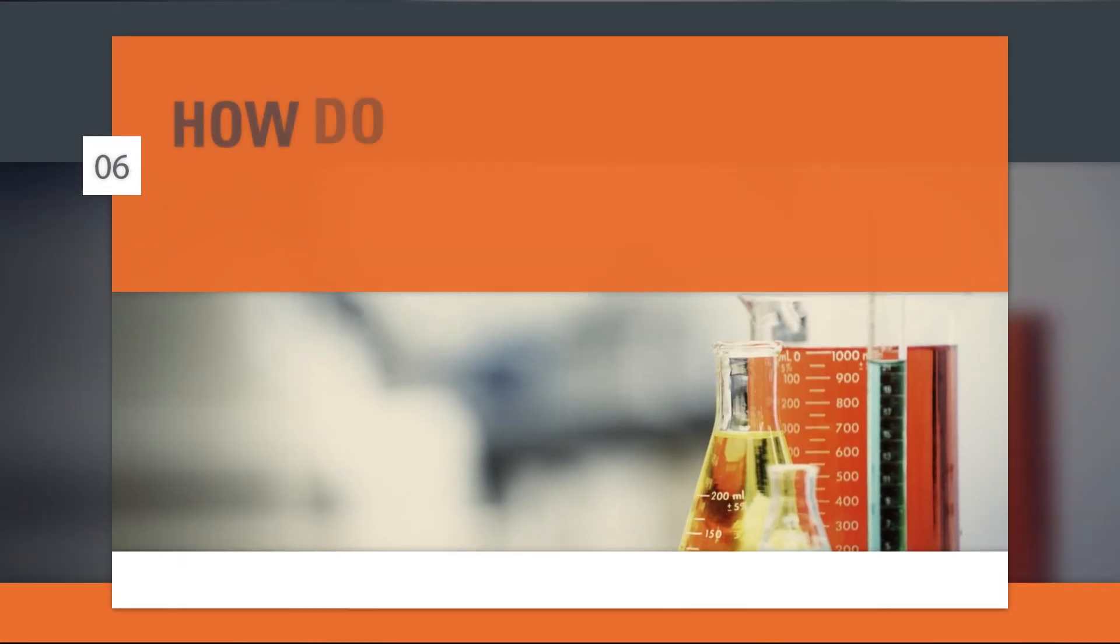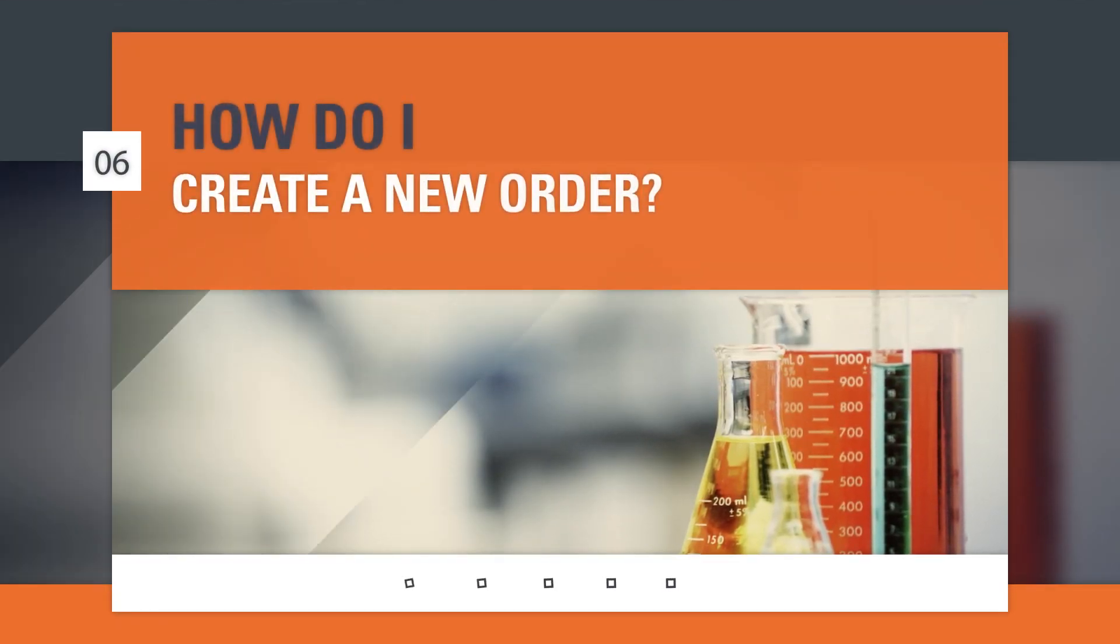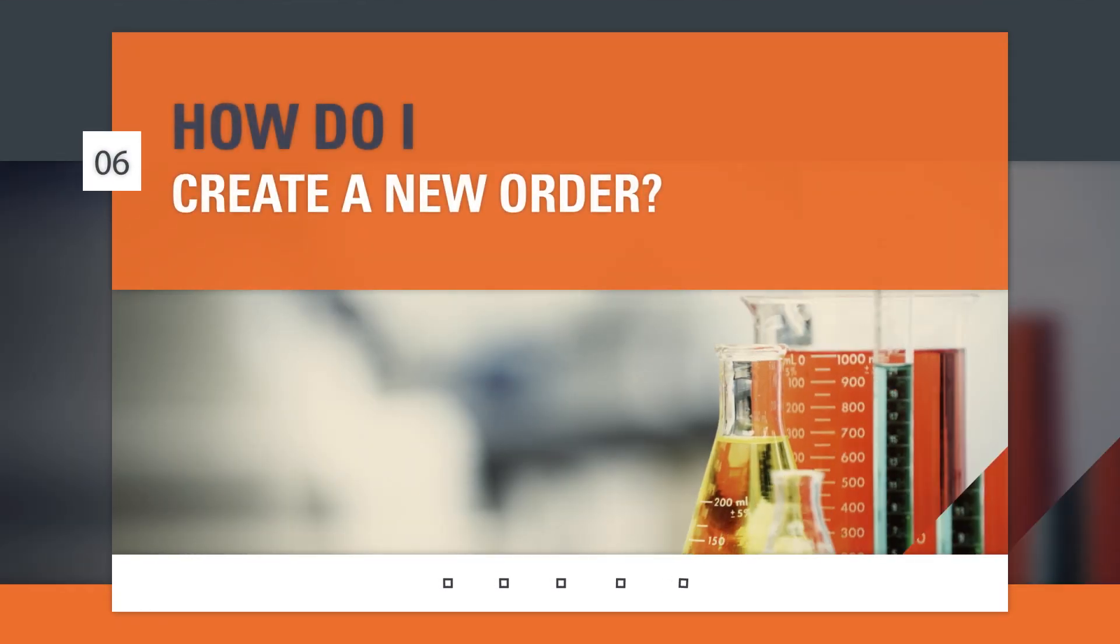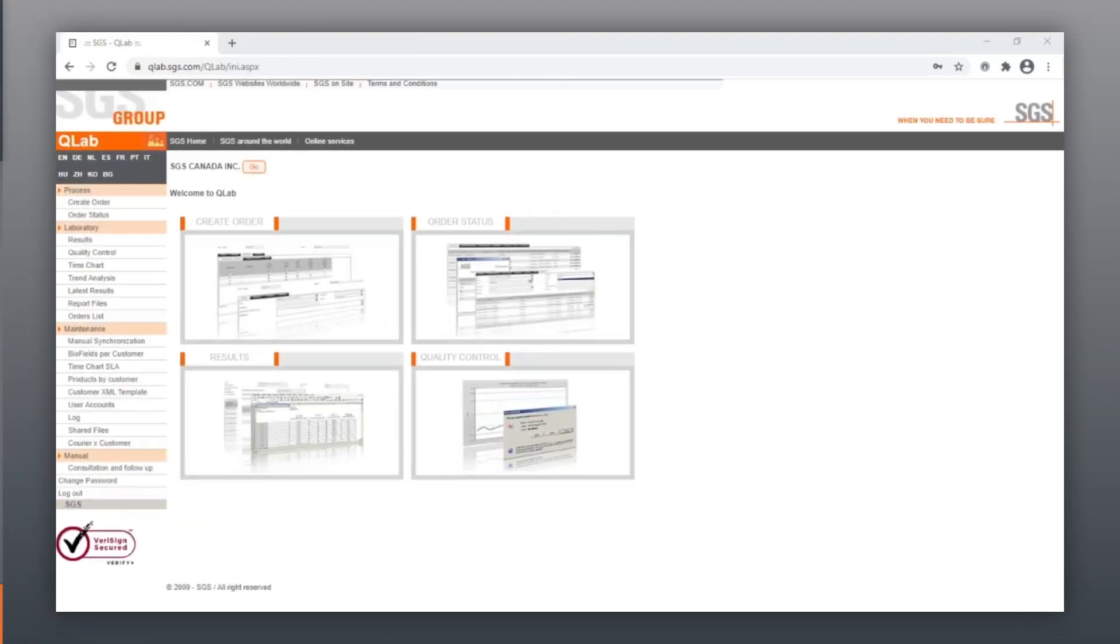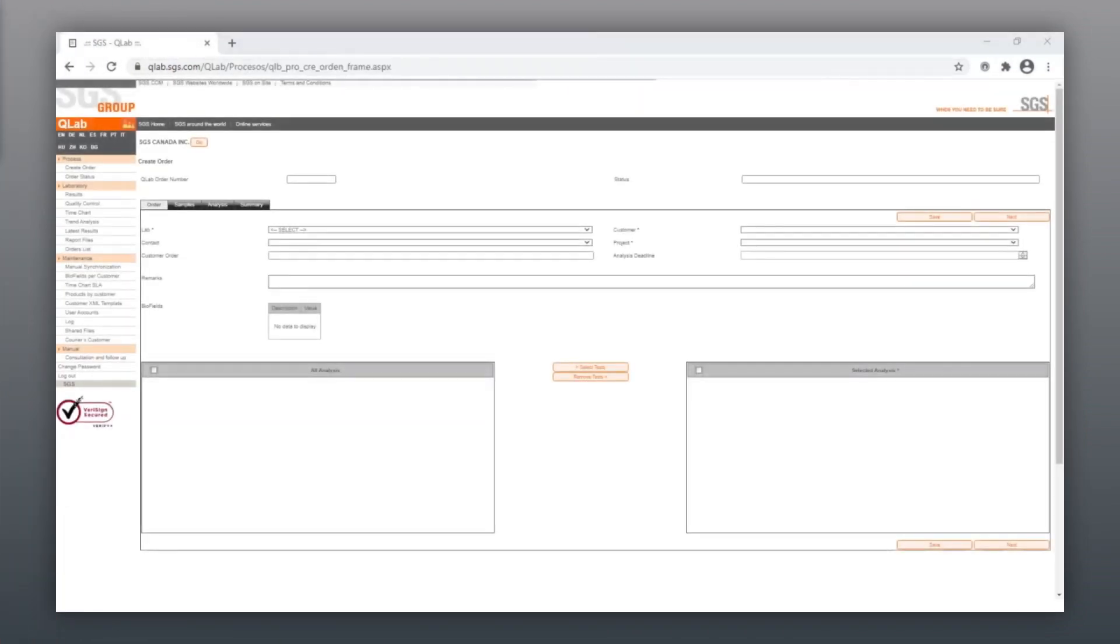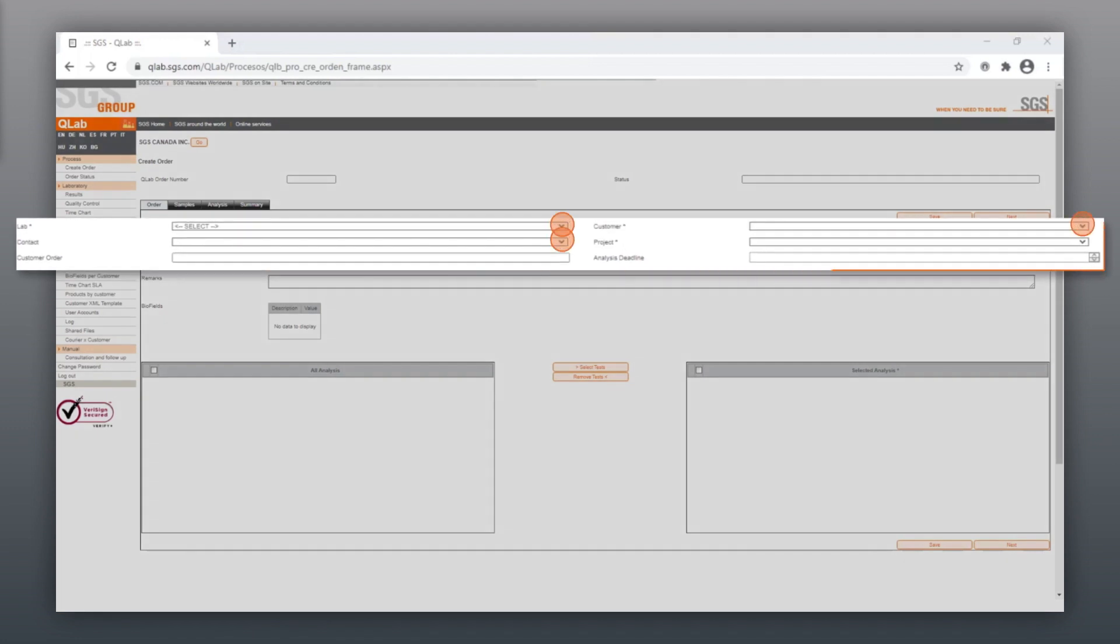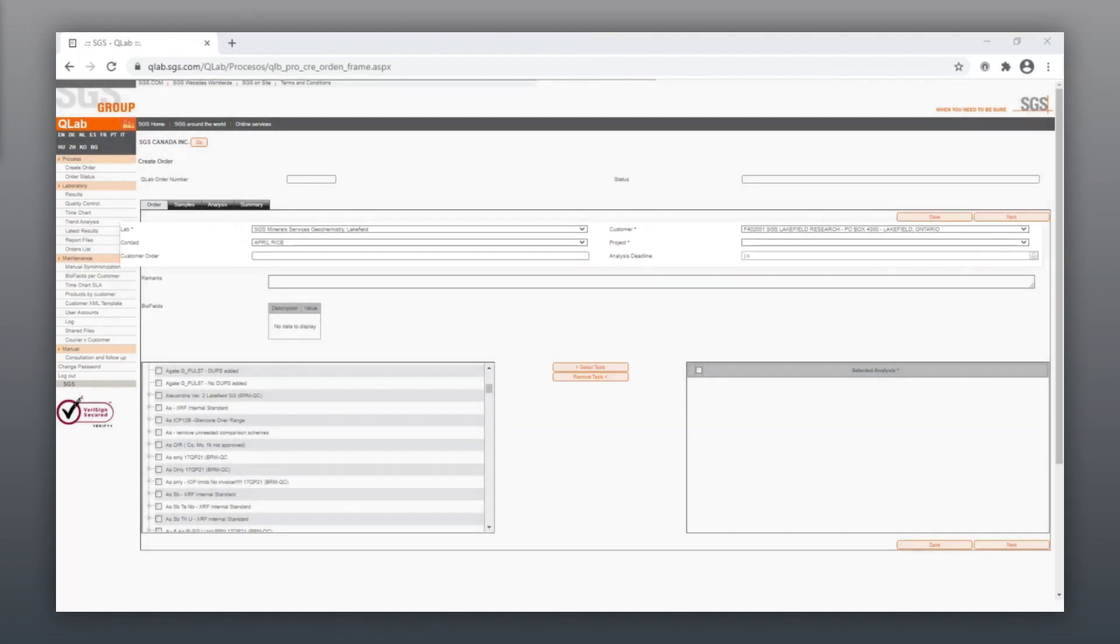How do I create a new order? First, identify the lab for sample submission from the drop-down menu and complete your customer and contact details. Once your contact details have been entered, you can select your analysis methods.